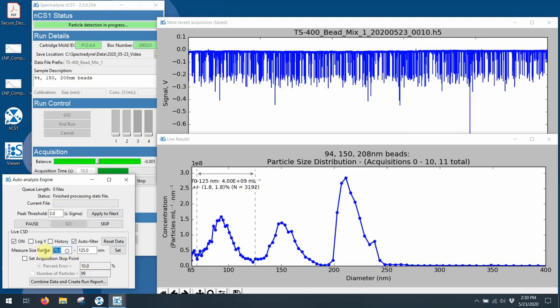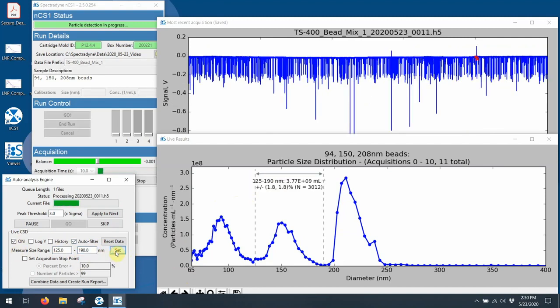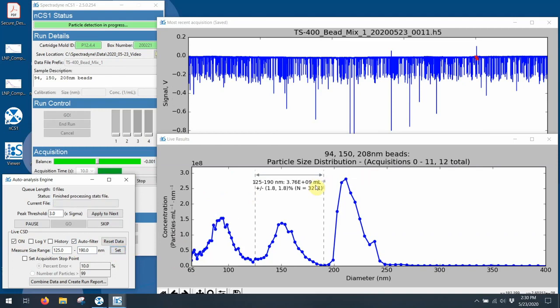Let's look at the next peak. So we can simply go from 125 to 190. Set that. And again, we see roughly 4 times 10 to the 9th particles per ml, which is exactly how I mixed this. I mixed this to be roughly 4 times 10 to the 9th particles per ml for each one of these.